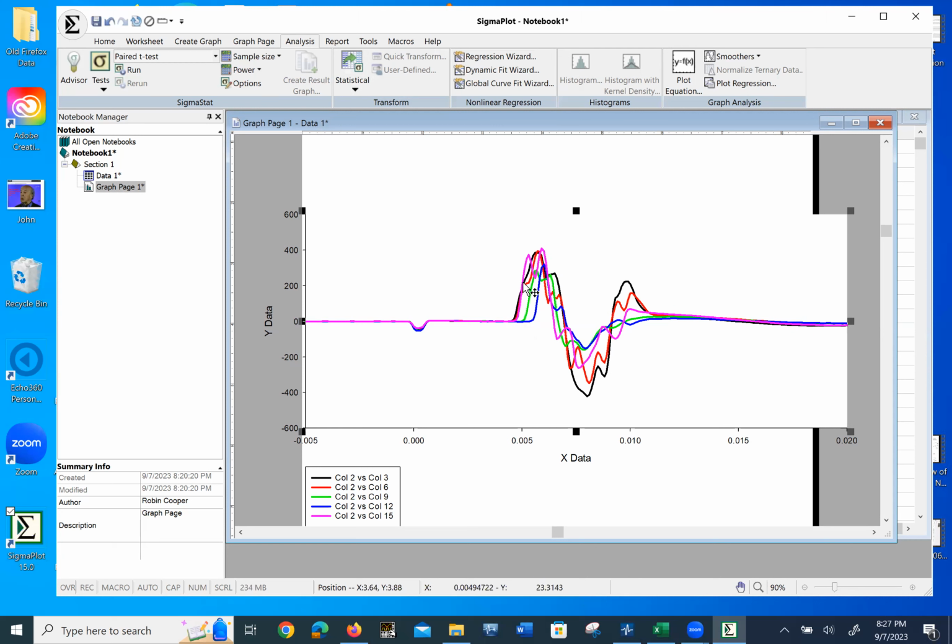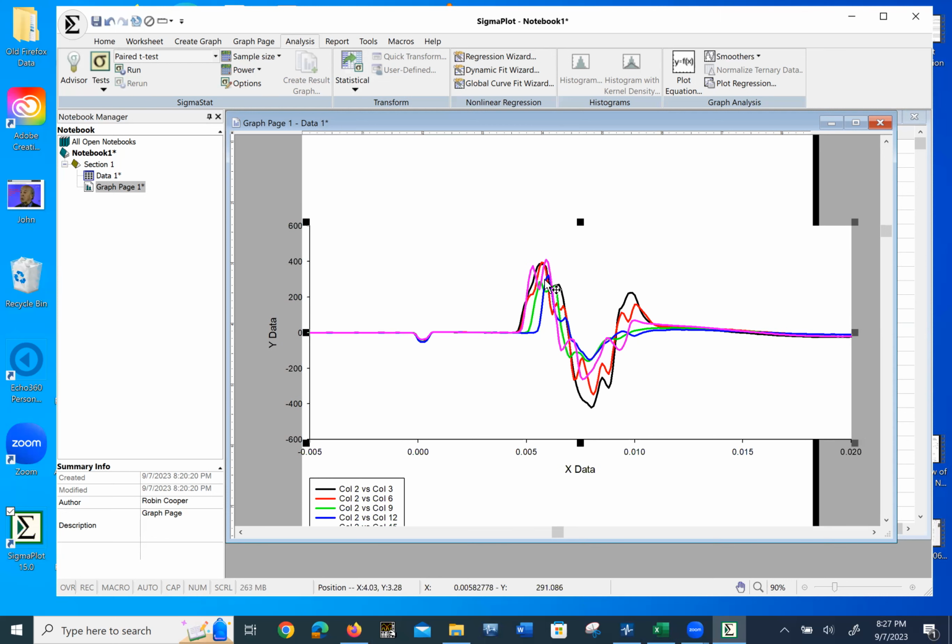Green was after 15 minutes. Look at it, it changed the time. It became slower in conduction, and the amplitude became smaller, right? The green line compared to the black line. Now blue was after 30 minutes. It's about the same amplitude, but the waveform's really changed its shape quite a bit. This is smaller in some aspects here because the green had 2 bumps, and this has just got 1 and that little one, but it sure has delayed quite a bit.